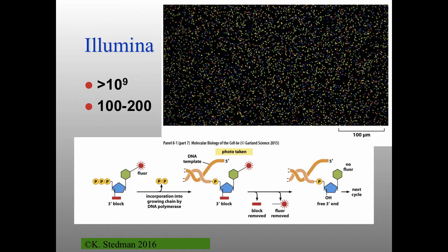And this is technology that was pioneered by a company called Illumina. Basically, it's almost exactly like dideoxy sequencing on a capillary, only here, it's done on a glass slide. So each of these little dots, of about 1 billion dots, represents one DNA sequence, one thing that you've split up. And then the colors in each of these dots represent one nucleotide that's been added, just like those different colored nucleotides that you have in capillary sequencing.